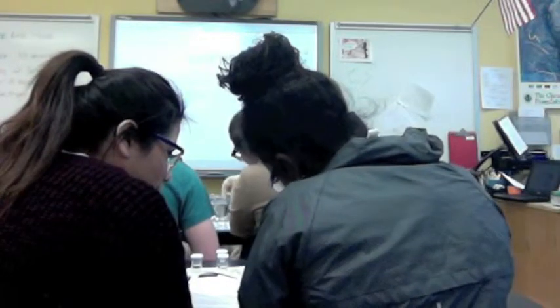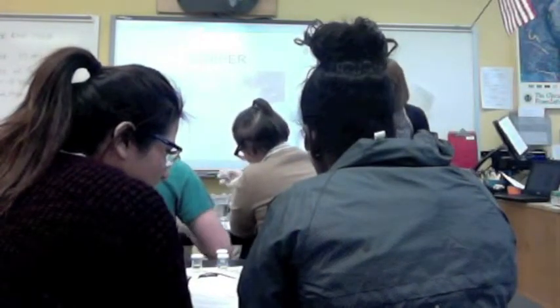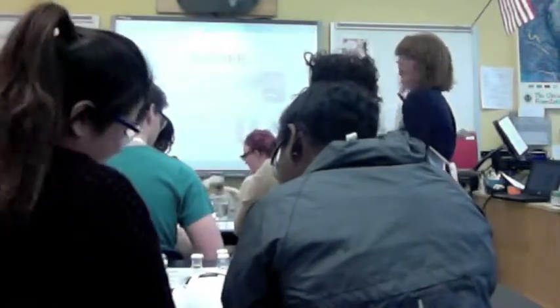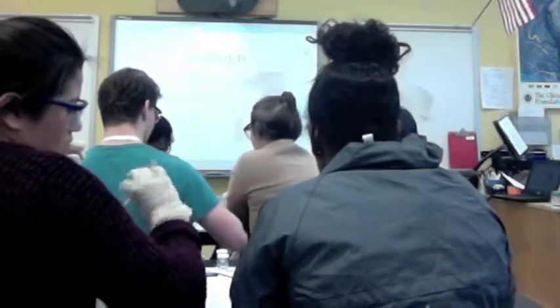Gently mix it. Can you use the pipette to mix? No. Thank you for asking. Lauren asked if you can use the pipette to mix, and the answer is no. All right. So far we have tested dissolved oxygen. Have we analyzed dissolved oxygen yet? No. And we are testing copper, and we are analyzing copper right now.